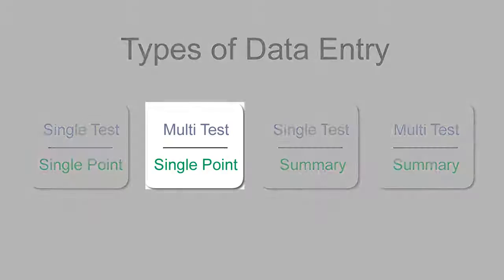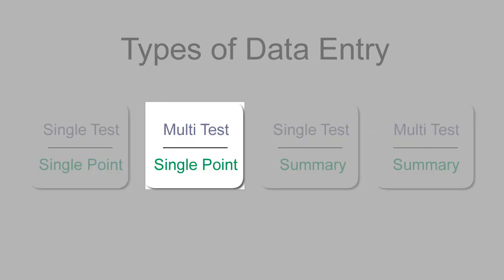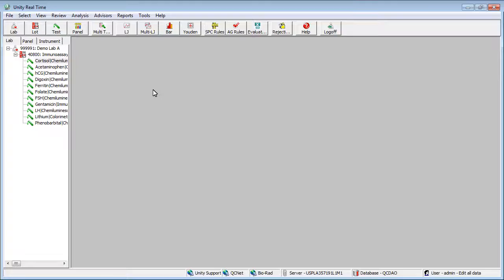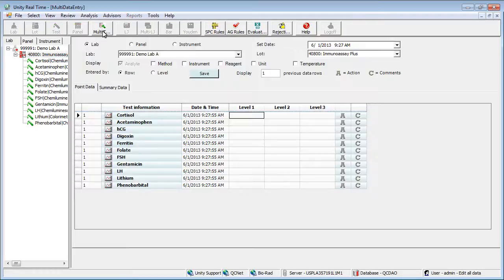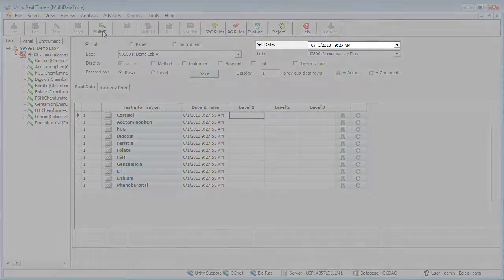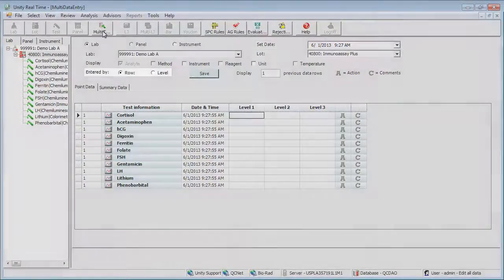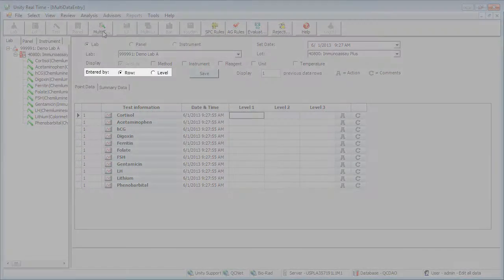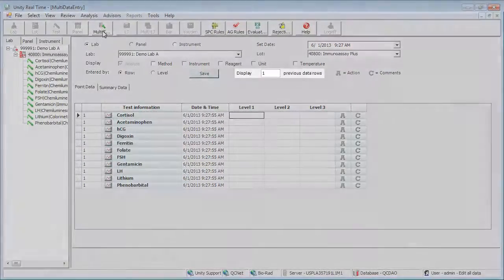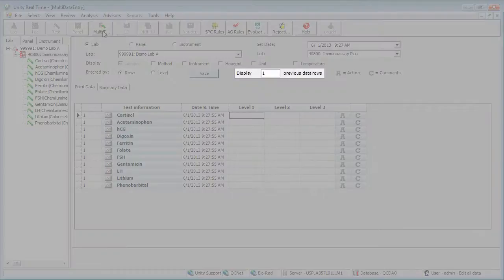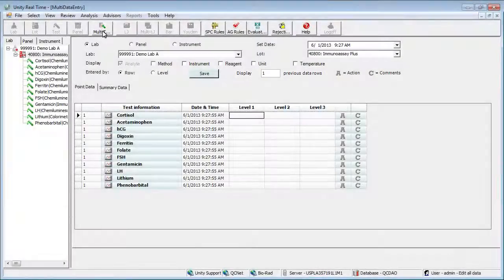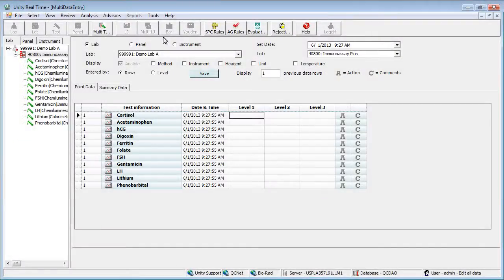Now we'll take a look at entering single point data for multiple tests at the same time. Select a lab and lot. Click the multi test data entry button. Set date allows you to set the date for all tests. You can enter data by row or level and determine how many rows you want to see prior to the current row. Enter your first value for the first test.